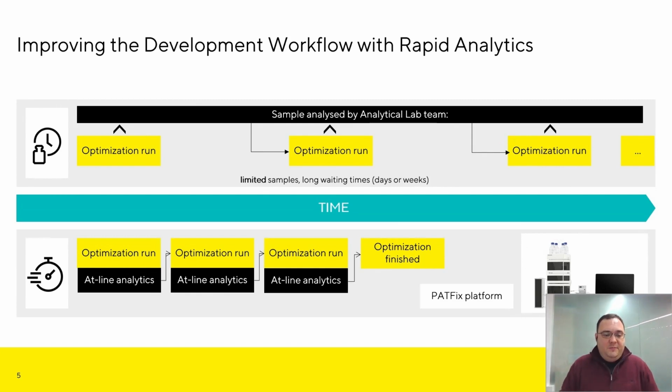A lot of this is because optimization runs are done, samples are collected. Sometimes you might be limited even by how many samples you can collect at a single time for a single optimization run. Then these samples are sent for analysis, and in the meantime, you might be doing some other optimization run while you wait for the results of that analysis to come back to you so you can act on it.